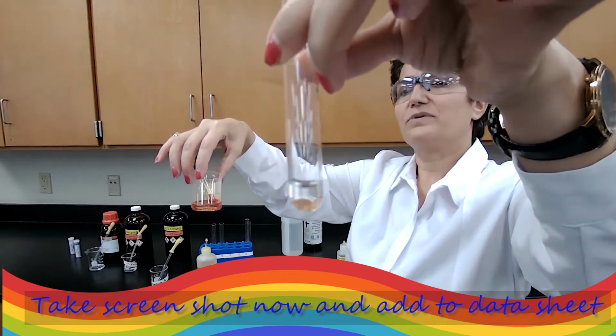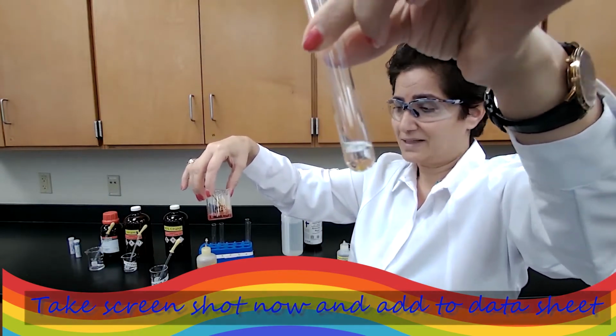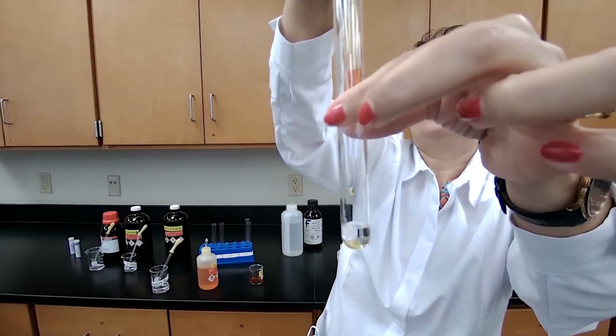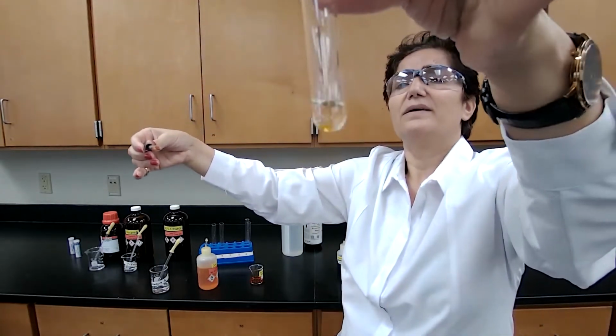So here's the observation. It doesn't look red, so it is a positive test because the color of the bromine, as I add it to this solution, disappears. So it turns clear now.